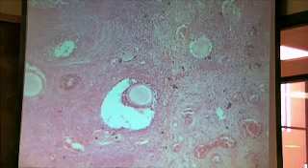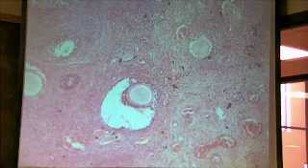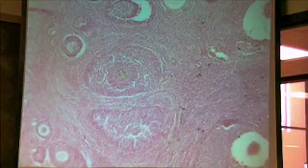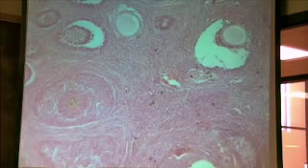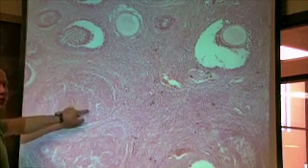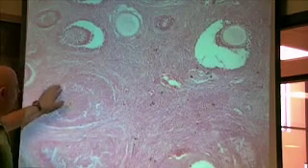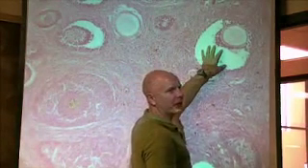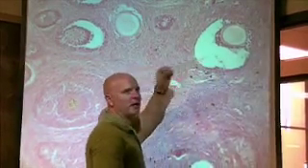Where were the secondary follicles again? Secondary follicles are all over the place, but to distinguish the secondary follicle, let me move these two here. This is showing a secondary follicle here. You don't have a clear antrum. You've got lots of cells here. There's the oocyte. All right. Here is a Graafian follicle. You've got a nice defined antrum.